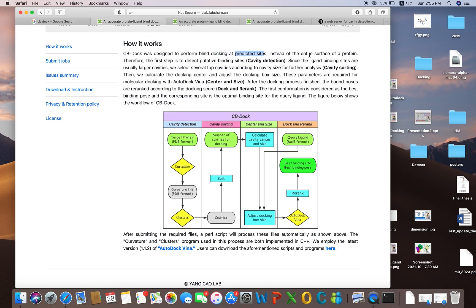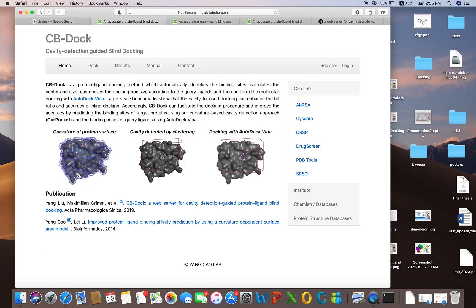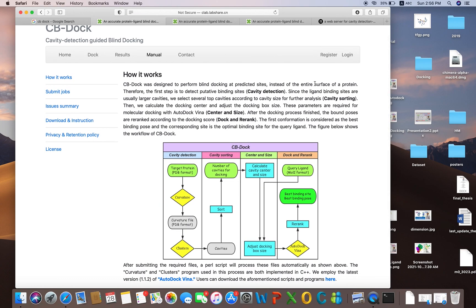CBDock performs blind docking at predicted sites instead of the entire surface of the protein. If you are working on standalone software and want to perform blind docking, you would have to select the whole protein or entire surface. But in CBDock, it detects cavities by clustering, makes clusters, finds out the cavities, and docks your ligand there.